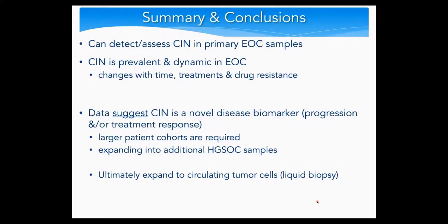So as far as the summary and conclusion for this vignette are concerned, we certainly can detect and assess CIN, that it's prevalent and dynamic in EOC, and that it changes with time, treatments, and drug resistance.